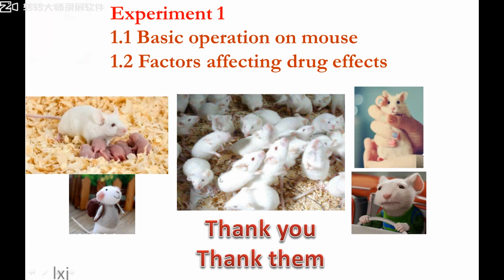Actually, this is a very special style for your experimental class, just because of the epidemic. Hopefully, we can get rid of this epidemic as soon as possible, so you can come back to campus, have your experimental class and deal with these animals.